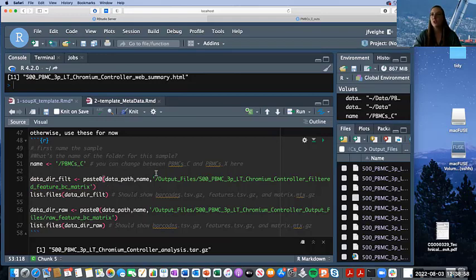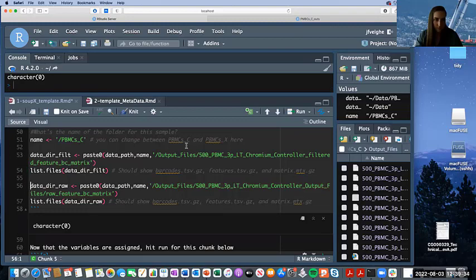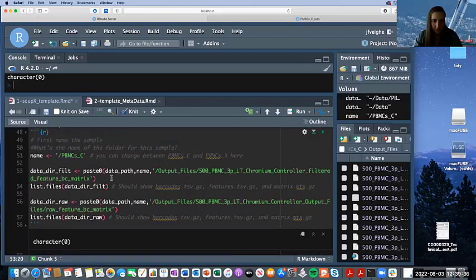Do you want to show her that? Or here, I'll copy these file paths into the chat for everyone. Perfect. Nope, still not getting it.